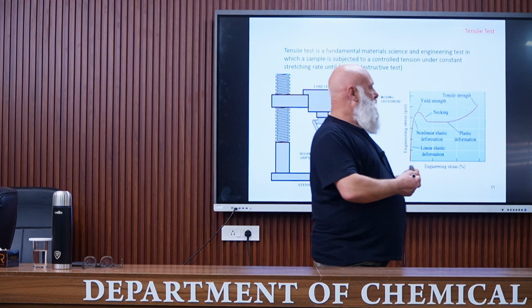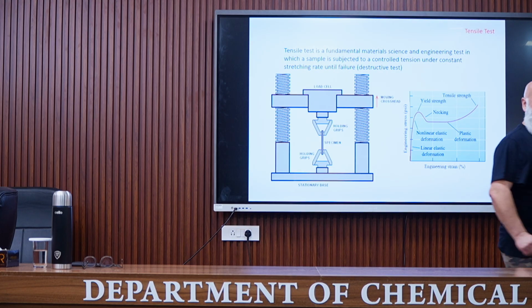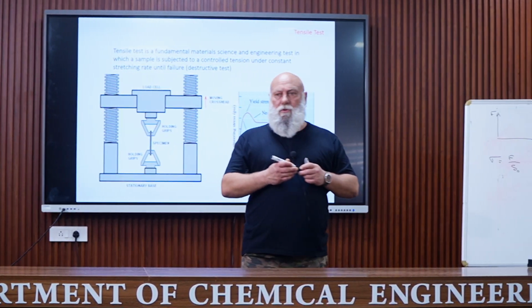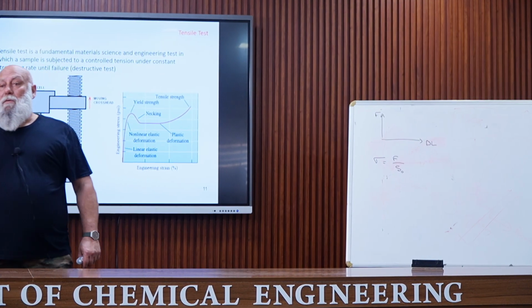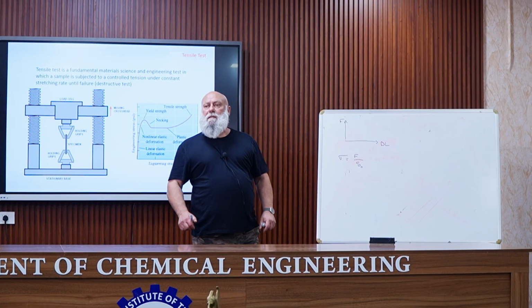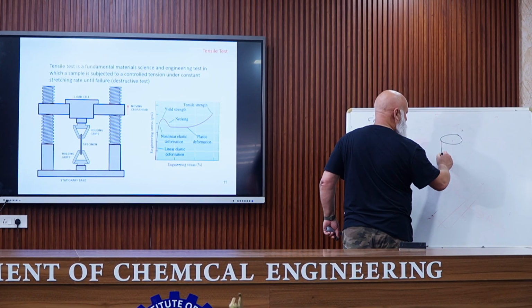How do you define the stress? The stress, sigma, is a ratio of the force divided by the section of the sample. Okay, so it means that it's in Newton per square meter or in Pascal. There are two types of stress that can be used. S0 here refers to the initial section of the sample. Imagine a sample in the form of a cylinder.